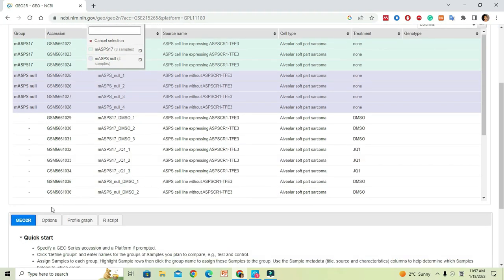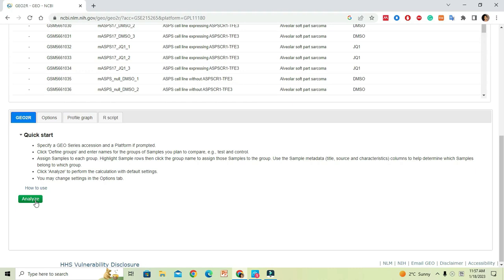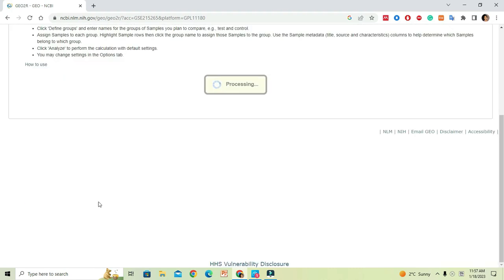Now scroll down and press the Analyze button. This process will take some time based on the size of the dataset and the server speed.